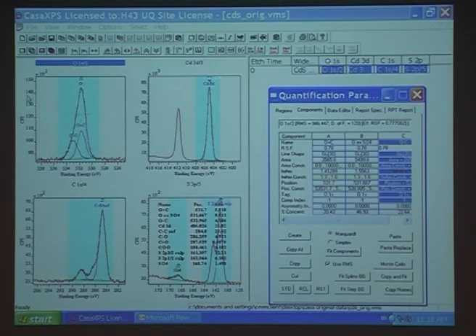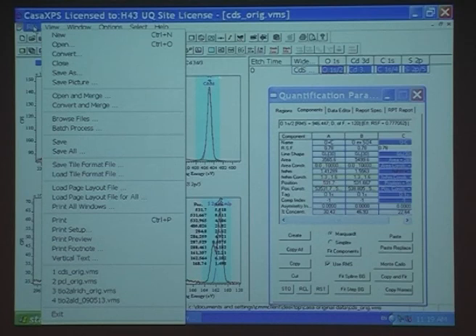Even cadmium sulfate, I think the binding energy might be very near the same. So sometimes the chemistry is not in one species alone. You have to look at the combination. We'll go on to the next one. We've got one more to do.